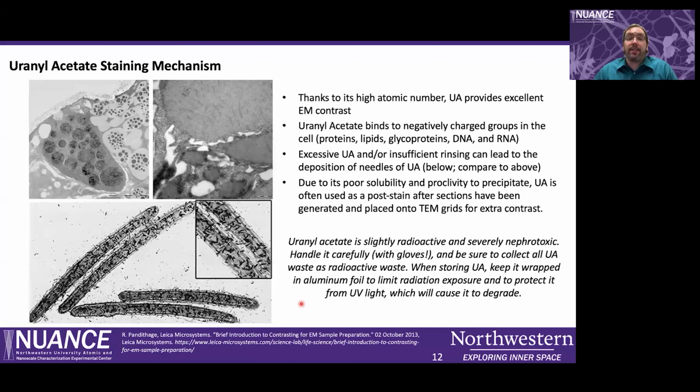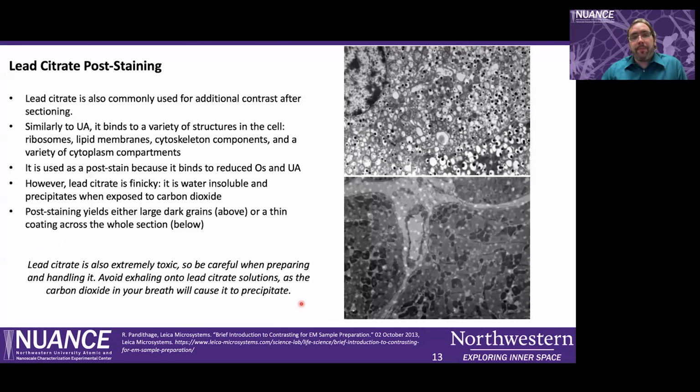And when you're storing uranyl acetate, it's important to keep it wrapped in aluminum foil as it will degrade when exposed to UV light. It's also slightly radioactive, so the aluminum foil is a safety thing for you as well, but mostly it keeps the uranium a little bit happier, so we can use it for a little bit longer.